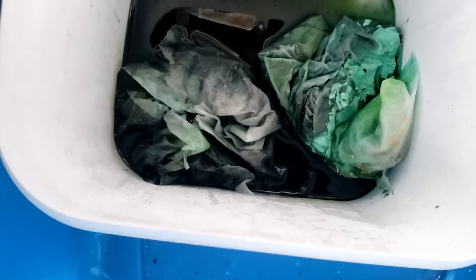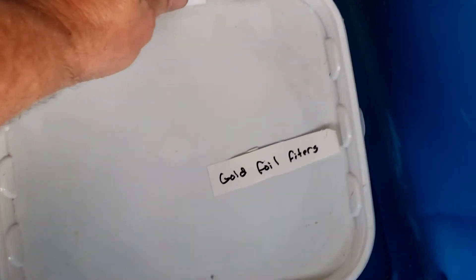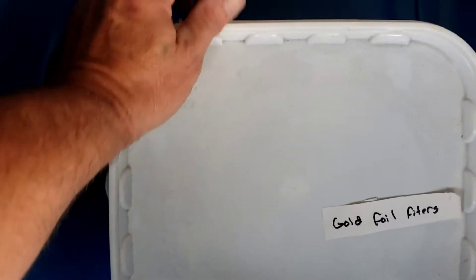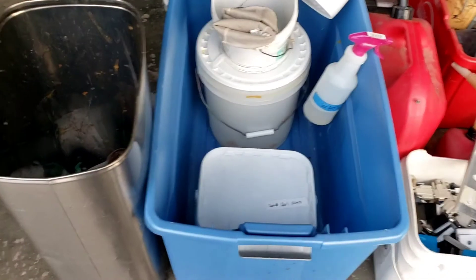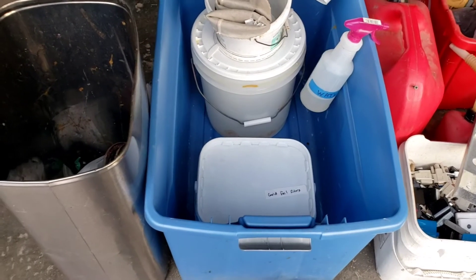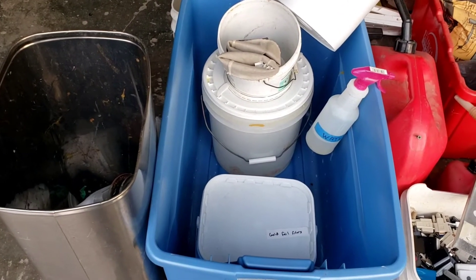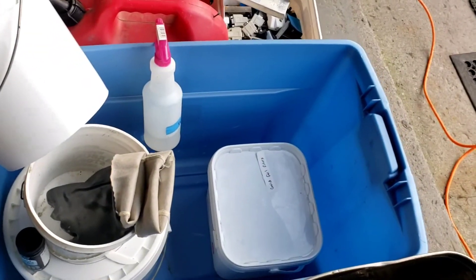I showed you guys that mess where I put gold fingers and gold pens all in the same thing. Well, I finally got all the pens to go into solution and release all the filters. It's September now, so that took six months to do it - but we've got it. There was no count, I didn't weigh what I put in, I just threw a whole bunch of stuff together.